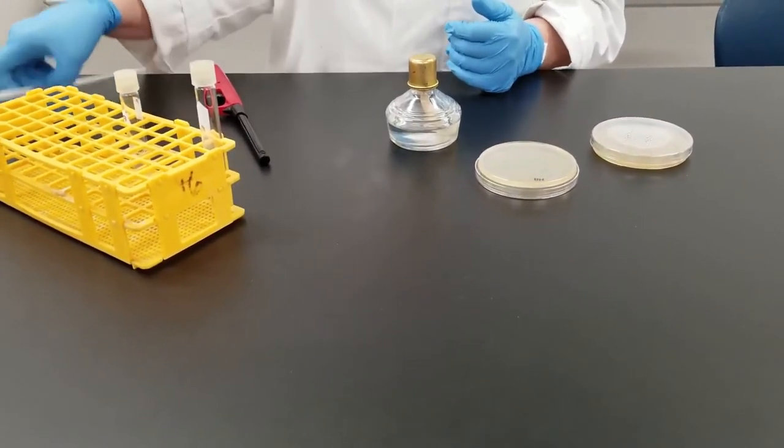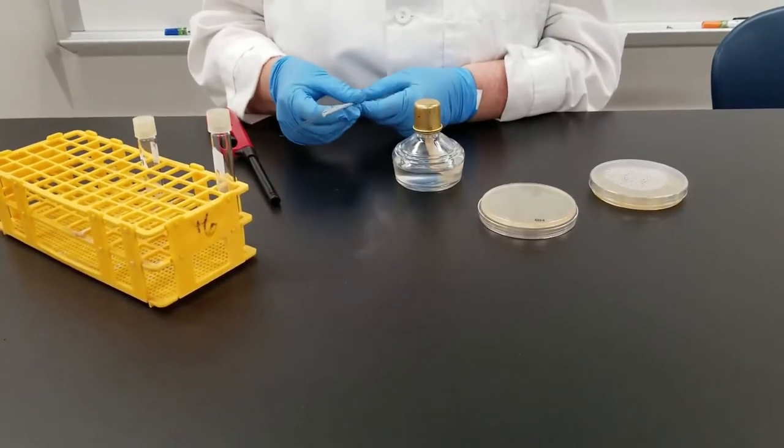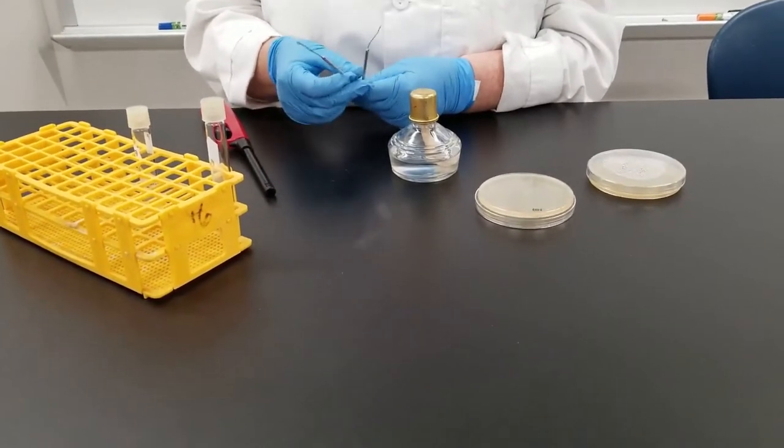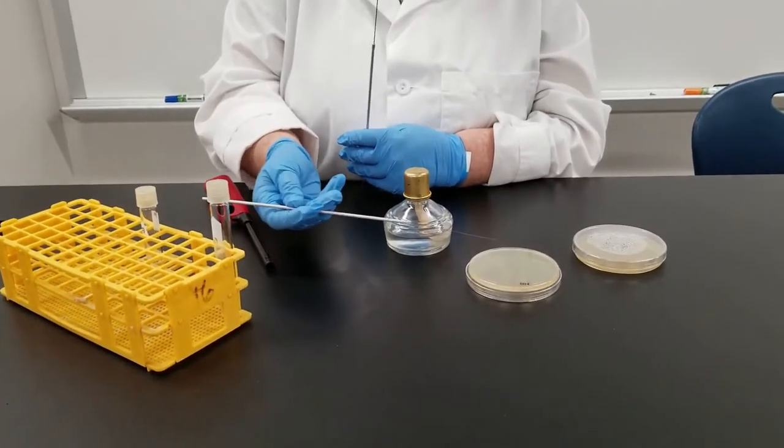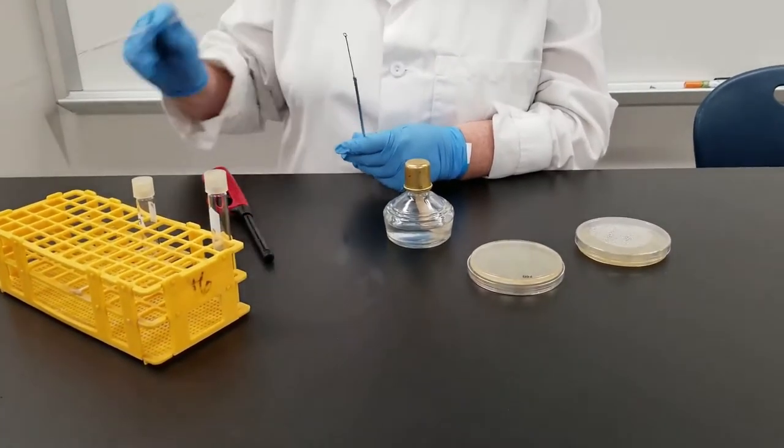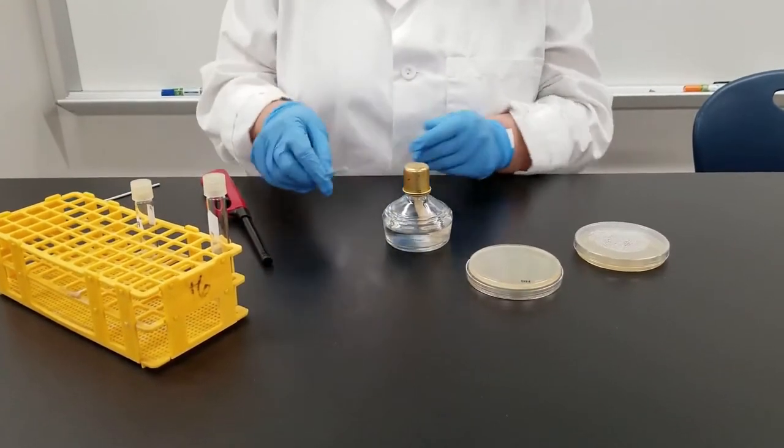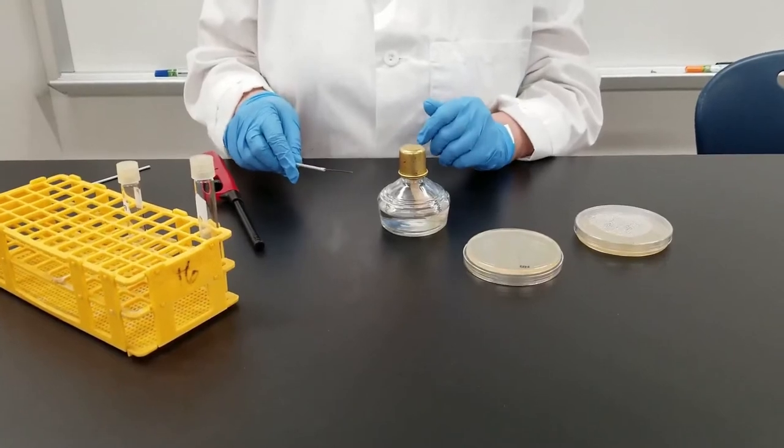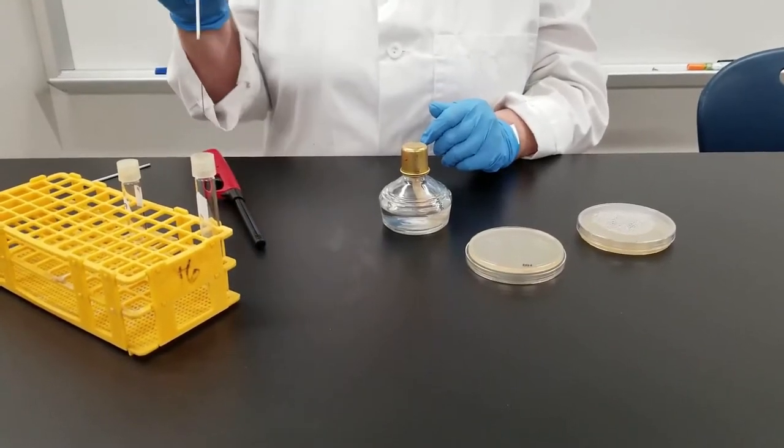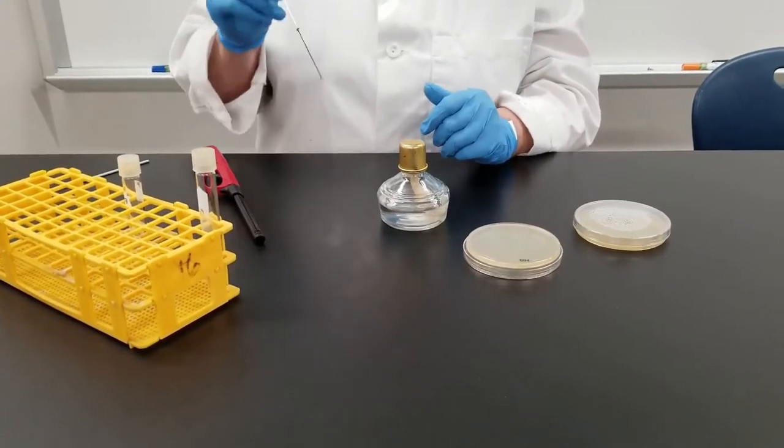Now we also have what we call our inoculating loops and needles. An inoculating needle is just a straight piece here. We don't use that quite as often. The thing we use most often will be the inoculating loop. As you can tell, it has literally a loop at the end. And we'll use this to touch the bacteria in one medium and transfer it to another.